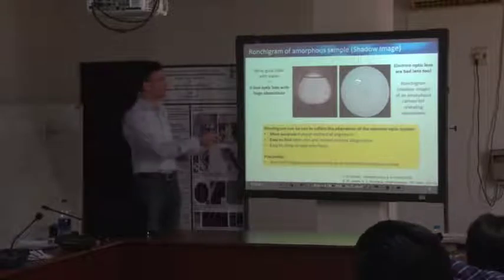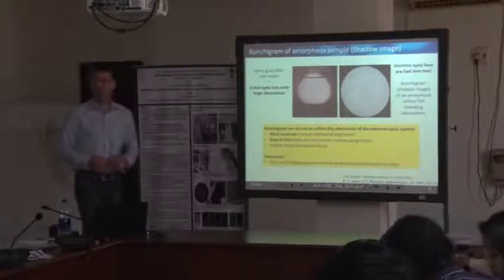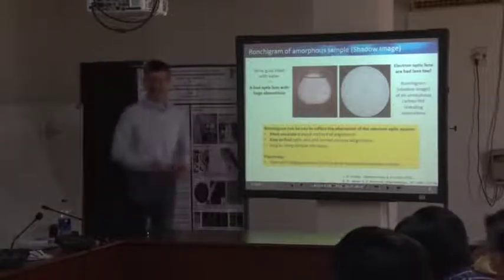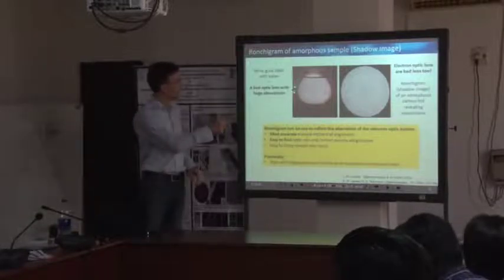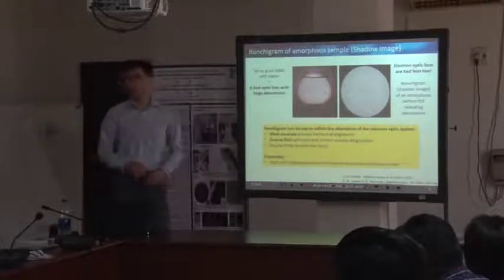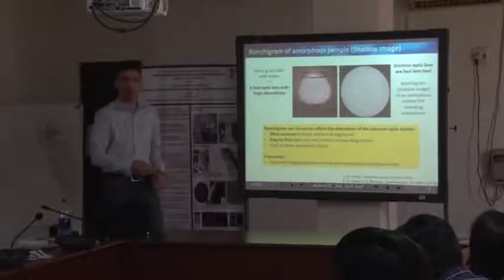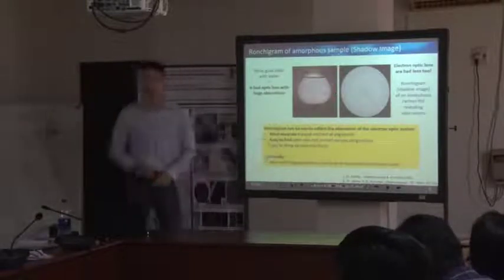And I would just like to demonstrate how that looks for another lens with very poor quality, huge aberrations. This is just a glass of water that magnifies the wallpaper behind it. You see in the center that this is a magnified image of the structure of the wall, so it magnifies. But in these outer regions we have huge aberrations.